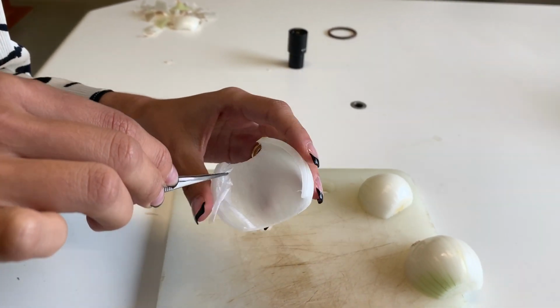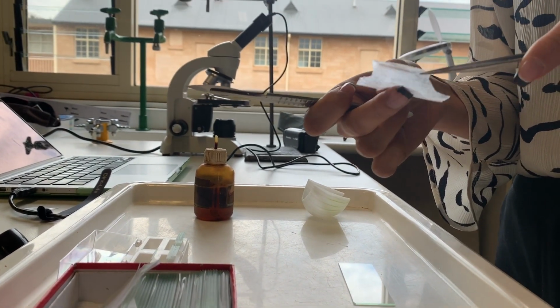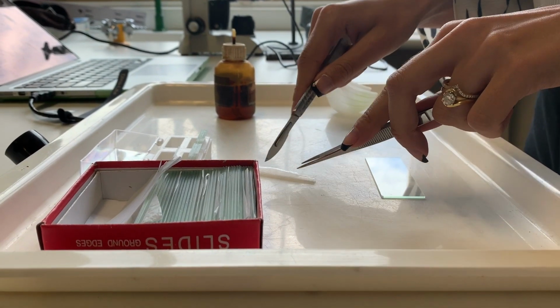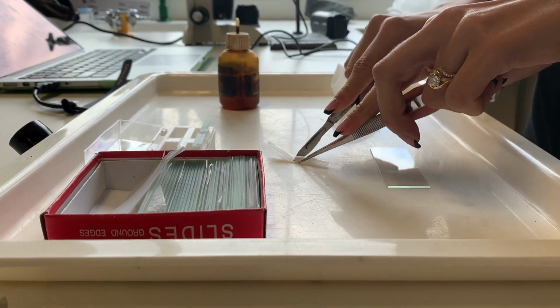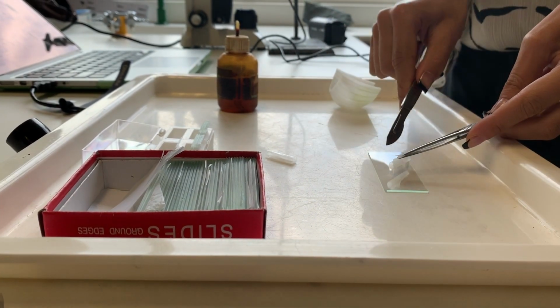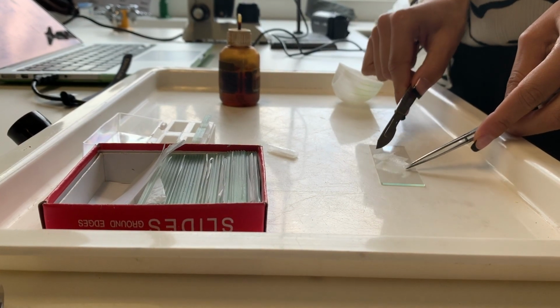And this is actually quite a nice large piece. So we can see our little onion piece is folding in on itself, so I'm just going to cut it because it's quite large and we don't need that under the microscope. And we'll spread that out onto our microscope slide.